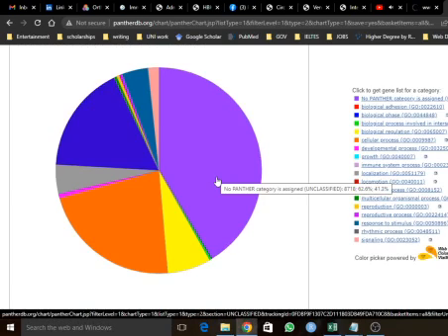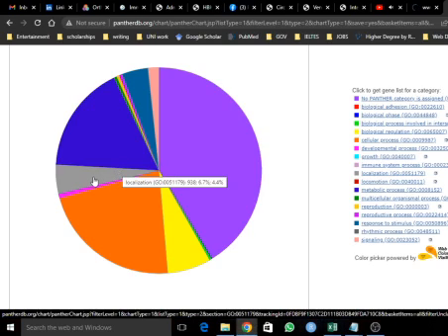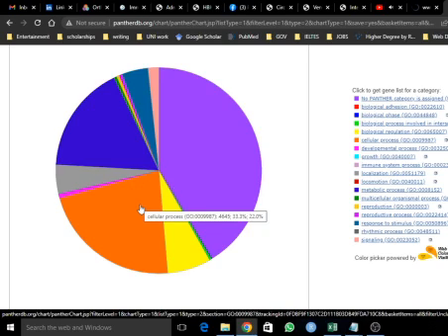They also explain that some data cannot be assigned in PANTHER because it cannot be classified or accepted by the PANTHER database. We must remove these data because they are in a kind of raw form. For example, in the list we uploaded, 938 genes are involved in localization as well as cellular process.